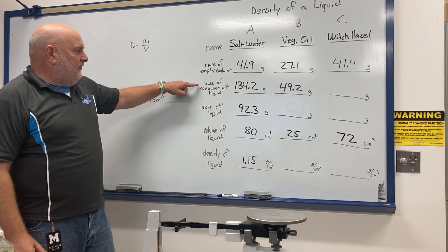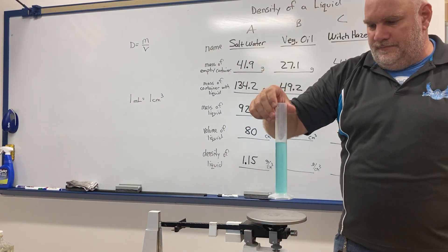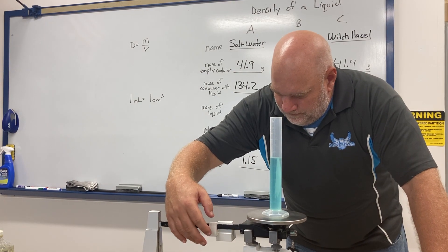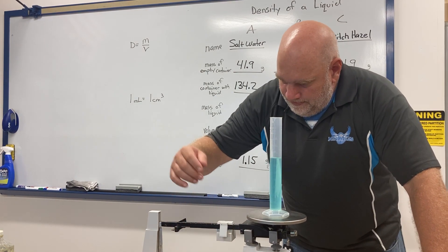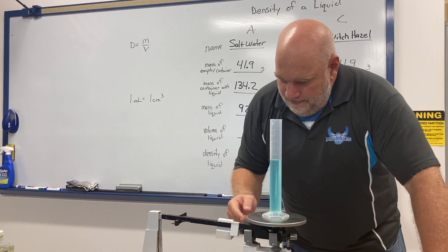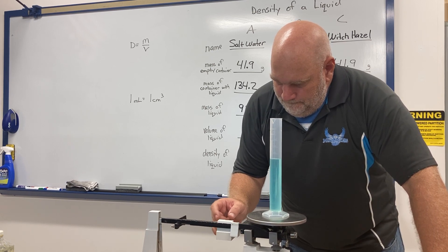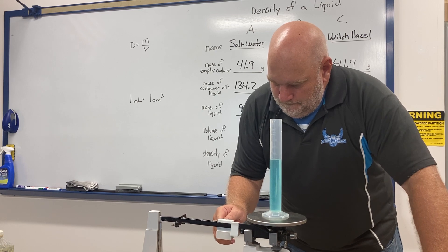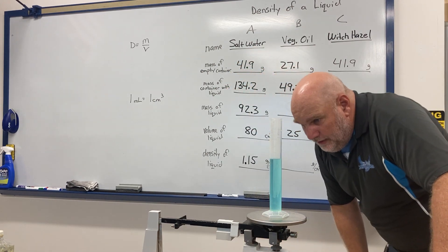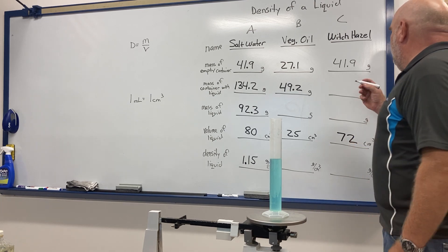Now I need to find the mass of the container with the liquid. I have the graduated cylinder with the witch hazel in it and I put it on the triple beam balance. I read 105.2 grams.